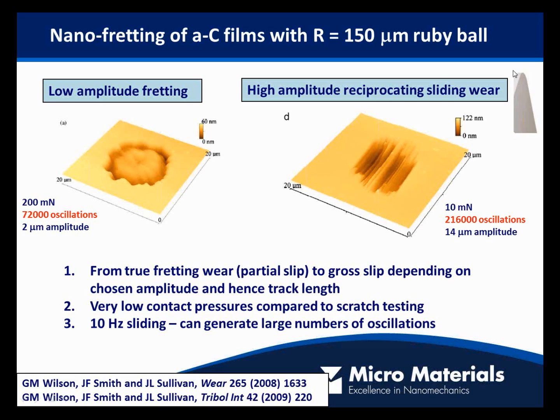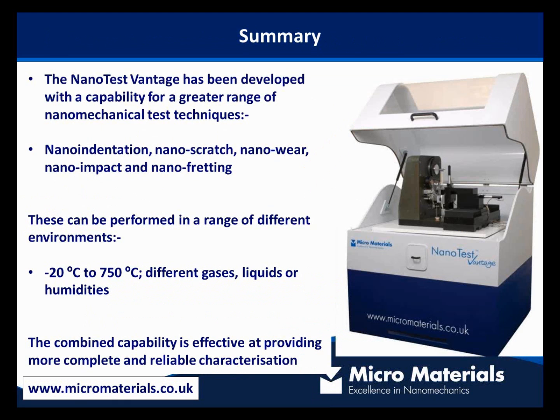Okay, so I hope you found that interesting. And to summarise, there's more information that you can get out of characterisation of mechanical properties of materials at the nano and micro scale when you are not just interested in the hardness and the modulus, but you consider some of this other information, such as their tribological behaviour and their sensitivity to different conditions.